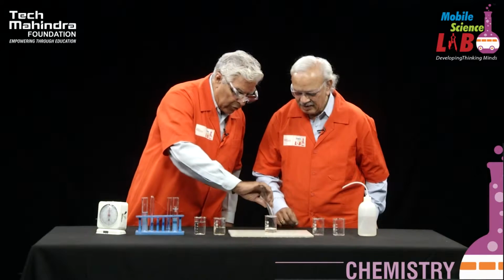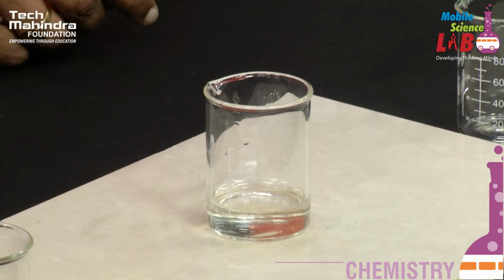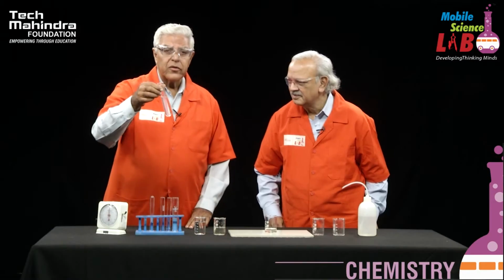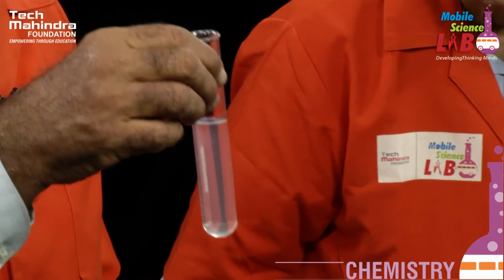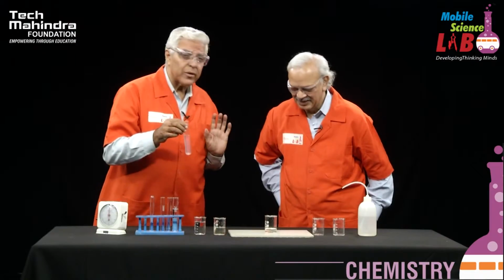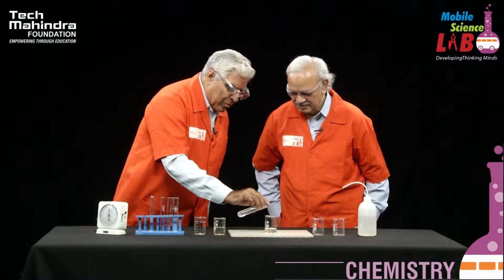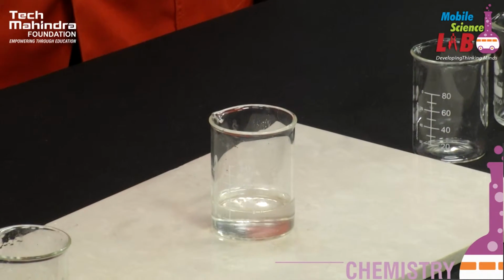Now, we add this to it. Shall I add this into this? So, here we have potassium persulfate and hypo is sodium thiosulfate. Okay. Next, a starch is to be added. This is a solution of starch. Students, you must always remember, starch is a very specific indicator for iodine. The moment iodine reacts with starch, it gives a blue color. And starch is one indicator which you use not in drops but in ml. So I am going to just add a few without measuring it. Okay. I think that should be enough.